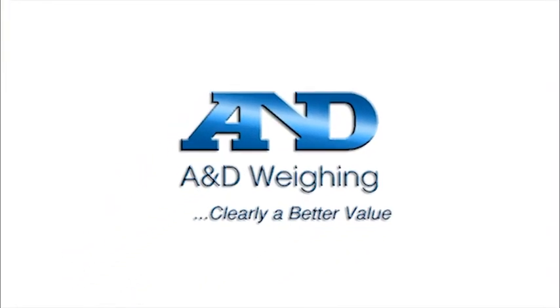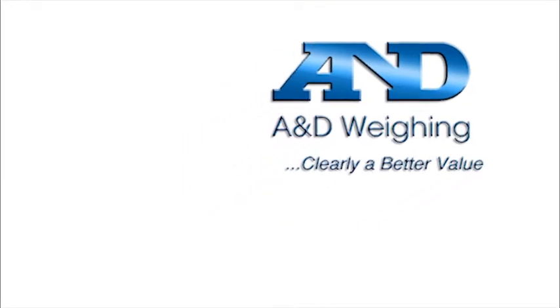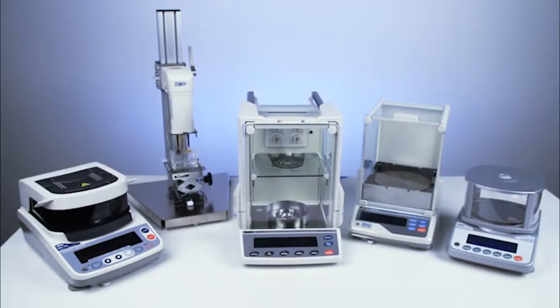The HRA series of compact analytical balances are available from the network of A&D dealers, who can help you select and maintain the right balance for your needs. Balances, micro balances, moisture analyzers, viscometers, and scales — from A&D.